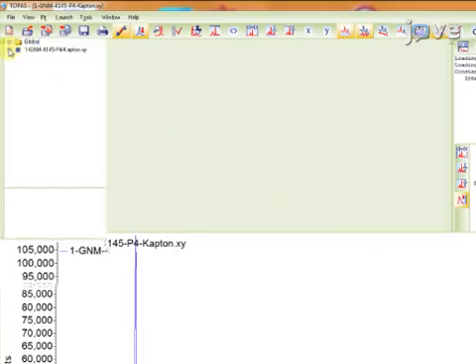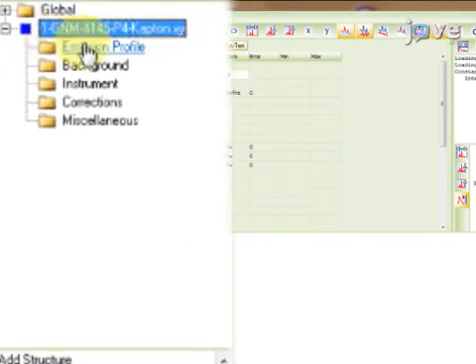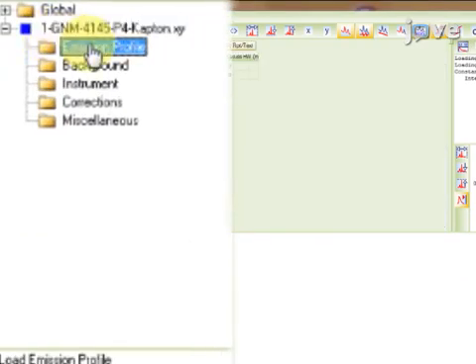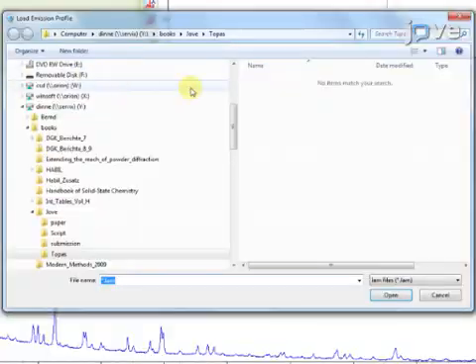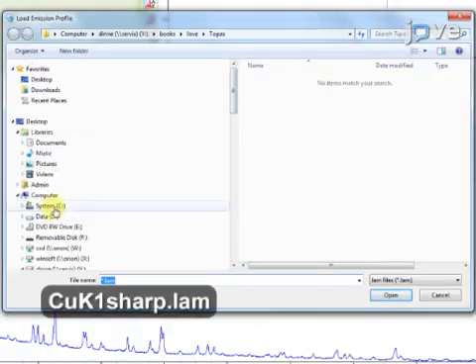Now expand the range of the file. Click on the Emission Profile tab, select Load Emission Profile, and choose the desired profile.